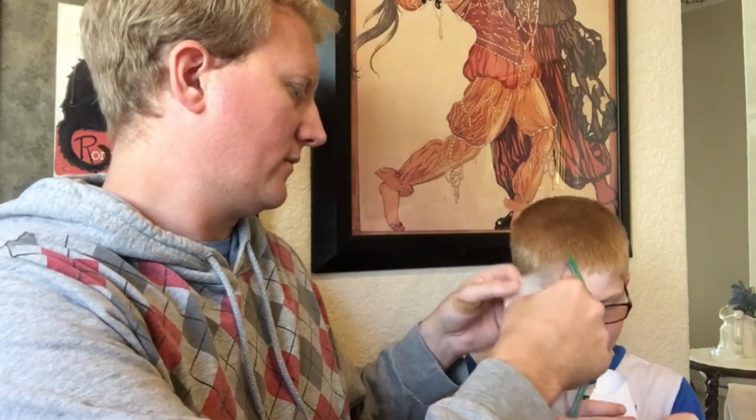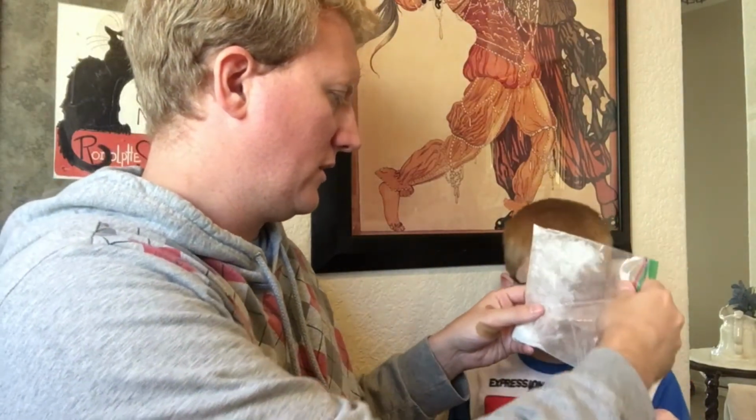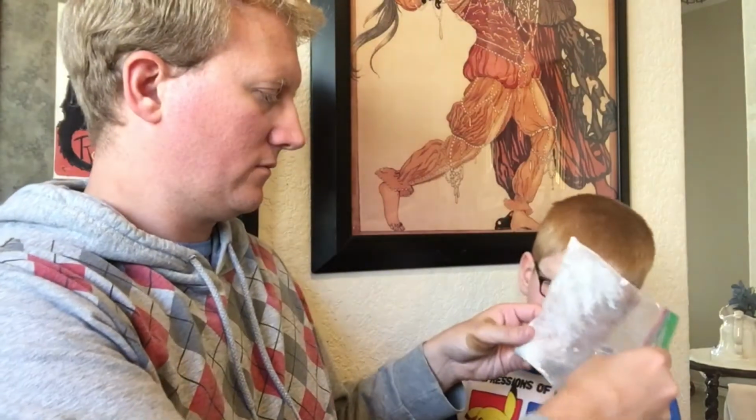We're going to use it to put our crushed up chalk. Can you hold that just like that? Hold the balloon on there. Okay, so we're going to put our chalk into the funnel. And like you already know probably, it goes into the balloon.